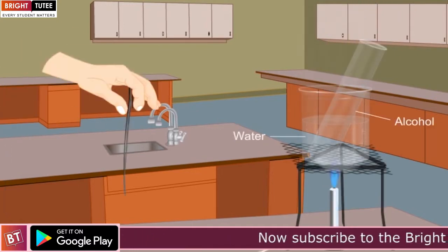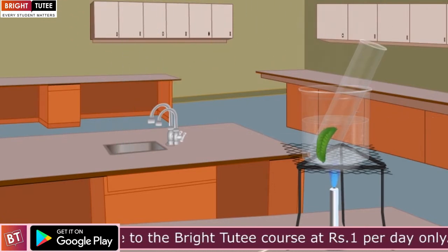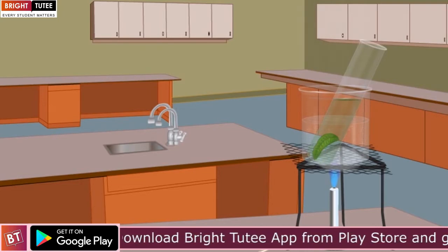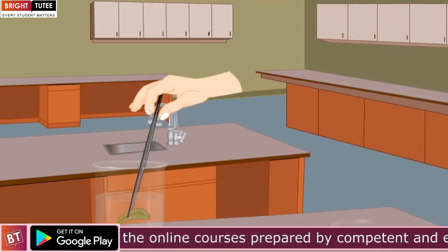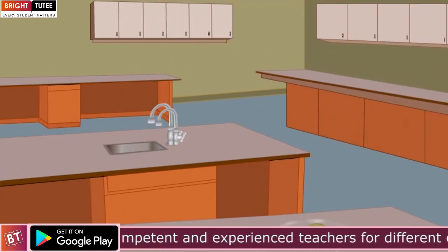Now, take a test tube, put some alcohol in it and dip the leaf in the alcohol. You have to heat this test tube put in a water bath. You should never heat the alcohol directly. Now, you will notice that the leaf is decolorized because its chlorophyll got dissolved in alcohol.